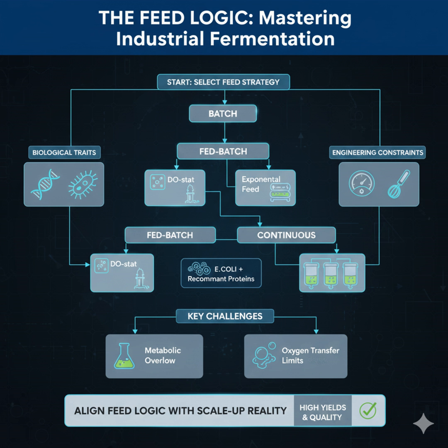I mean, before any hardware is even commissioned, before a single pump is set, step one is classifying that cell. We need to identify really 4 core factors that define its metabolic strategy. The first question is fundamental. Is the product formation growth associated or non-growth associated? Okay, so are you making the product while the cells are growing, or do you have to wait until after they grow? Exactly. If it's growth associated, the product flux just tracks the growth rate, mu.